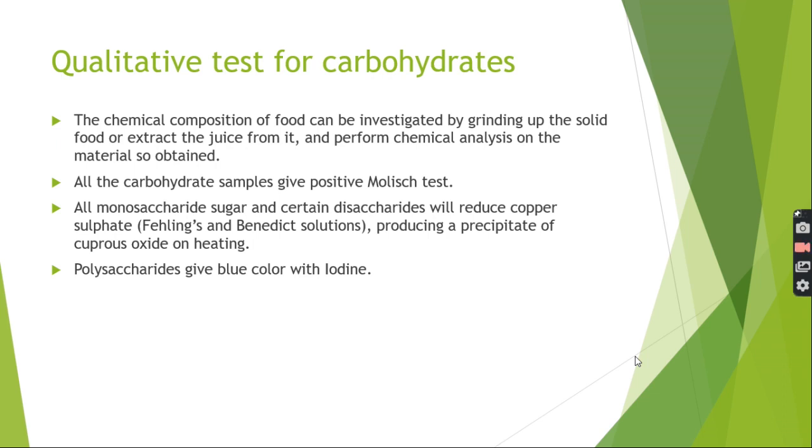So suppose an unknown carbohydrate or an unknown sample is given to you, you will use that flow chart to find out what steps you need in order to identify the carbohydrate. Okay, so different types of tests are there. I think I will first take you to that flow chart, and then we can come back and see the tests.